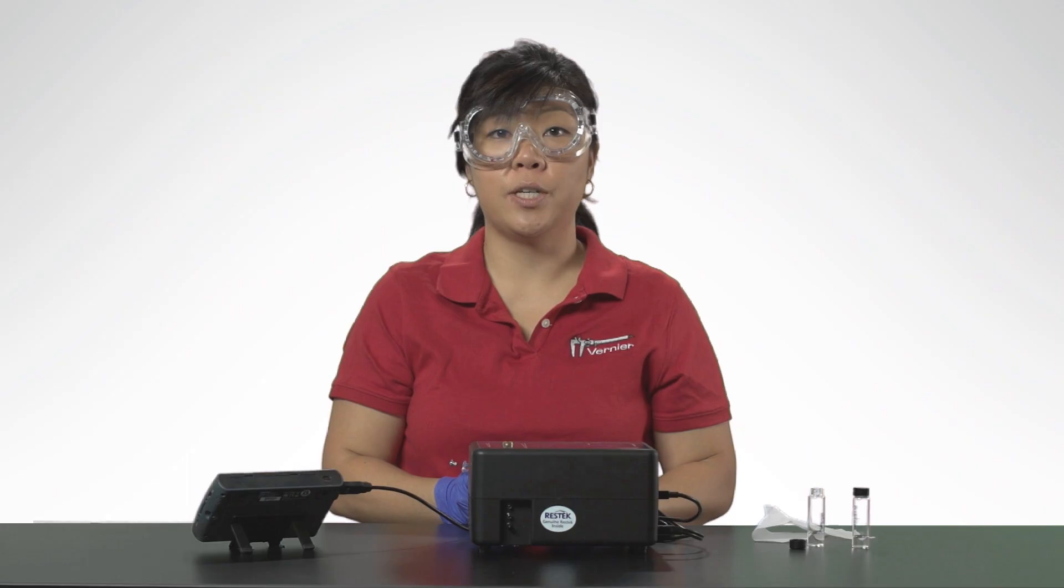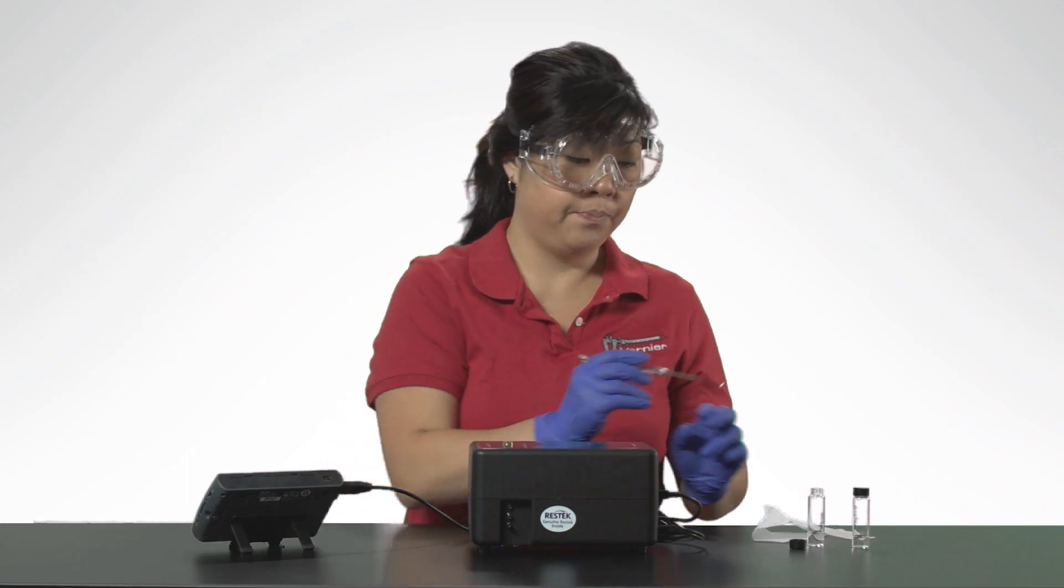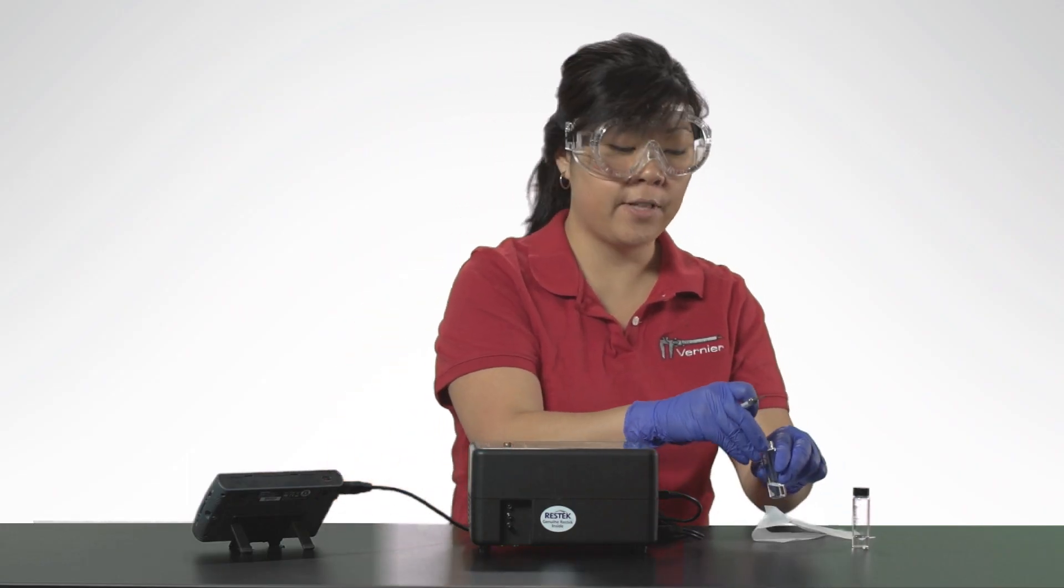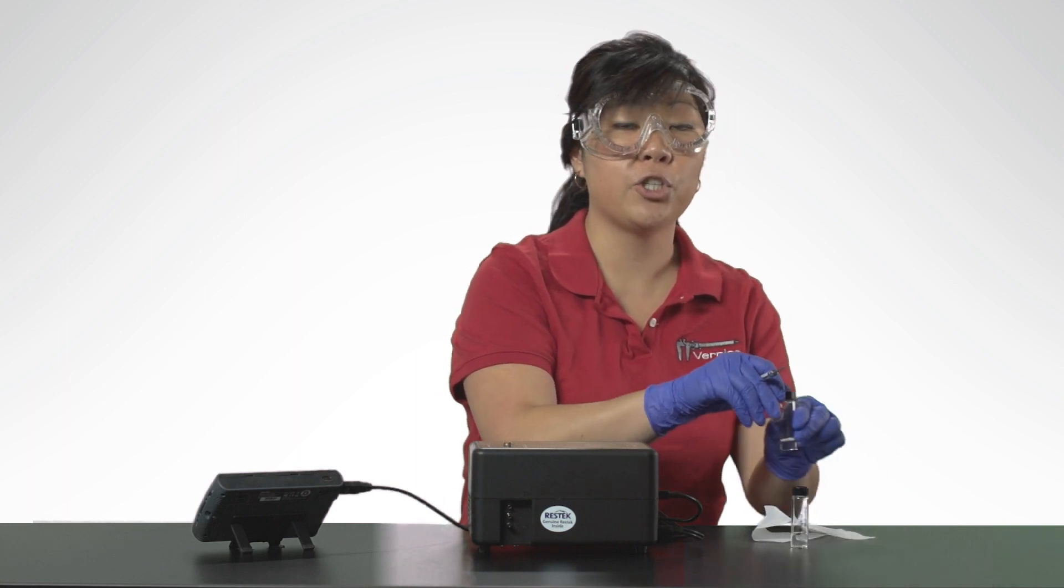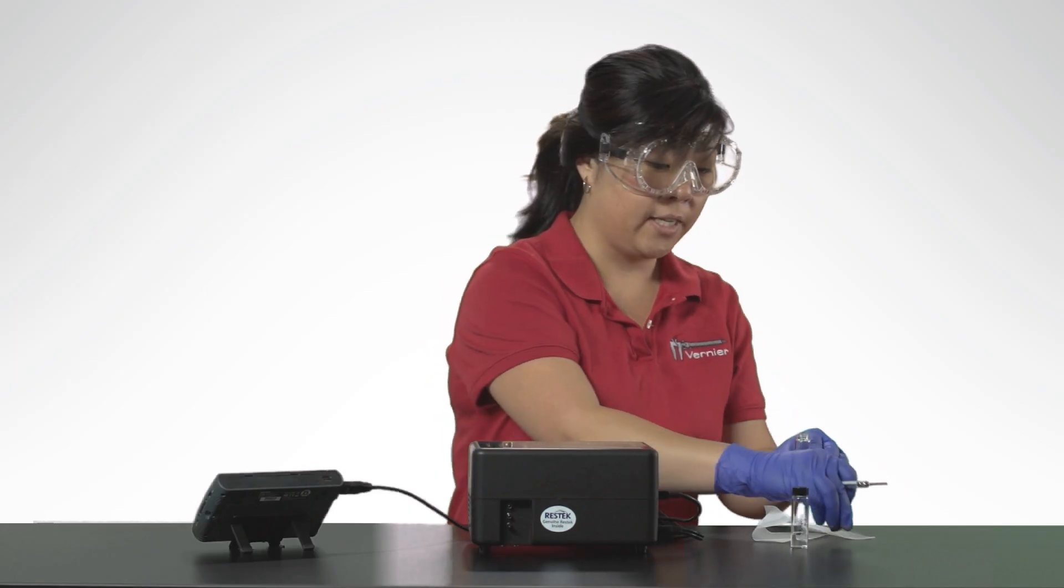While the data collection proceeds, thoroughly clean the syringe and needle with acetone. It may take more than three flushes to feel the syringe plunger move smoothly again, which is your indicator that the syringe and needle are both suitably clean.